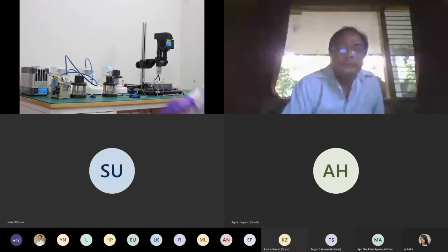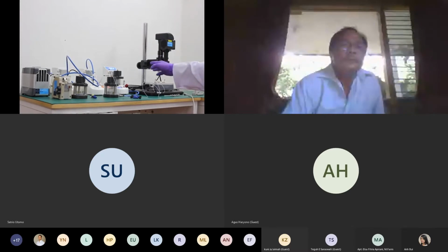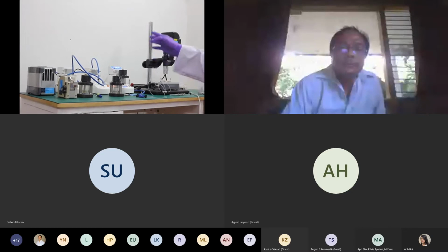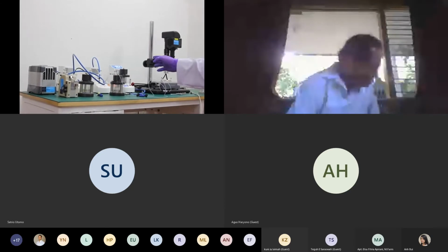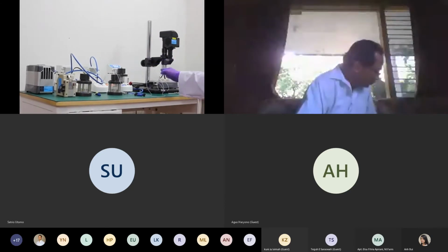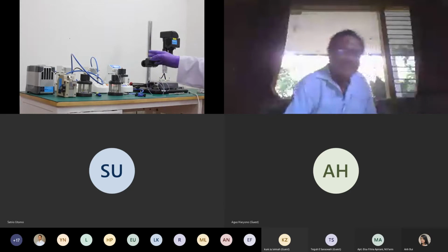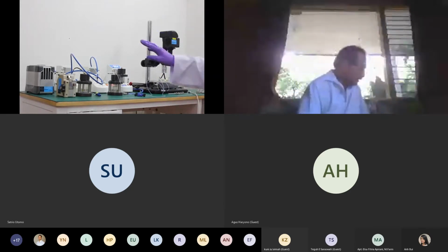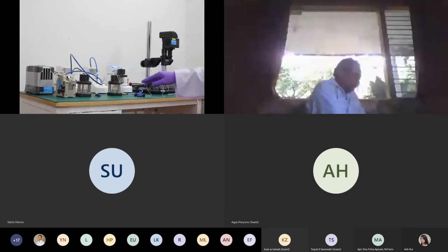Today we will run a demo of droplet formation, water in oil. Remember, I will use the hydrophobic chip. Oil is the continuous phase, and the droplet phase is water.